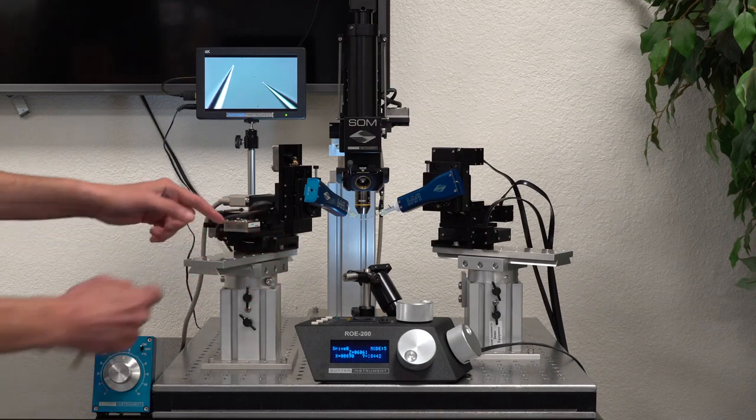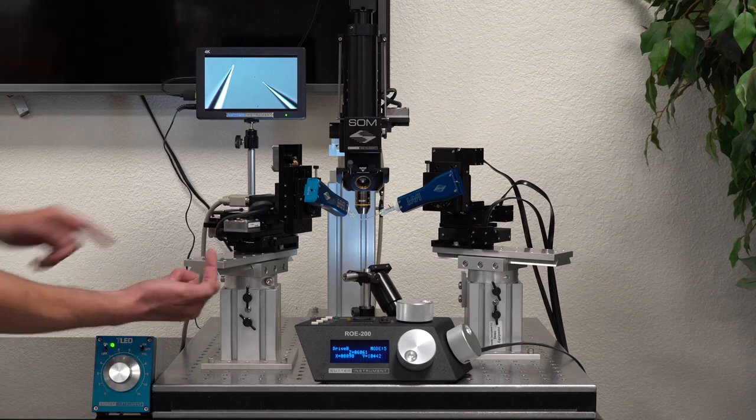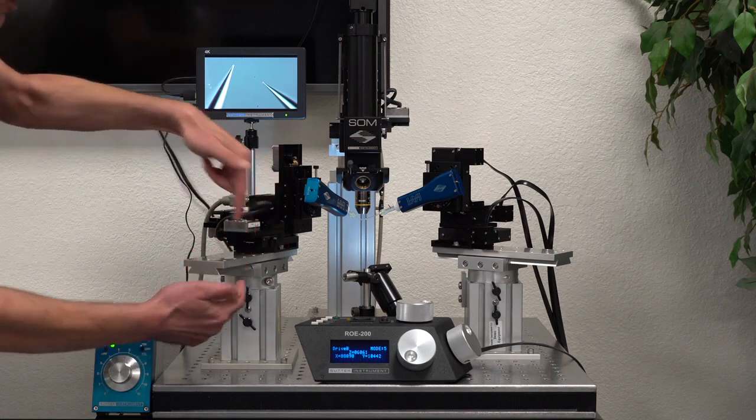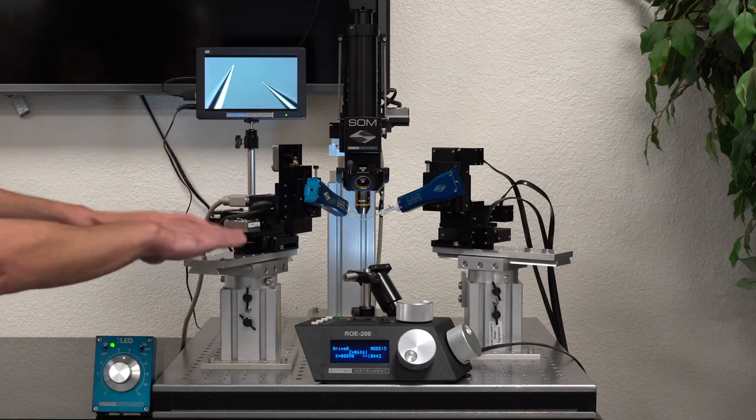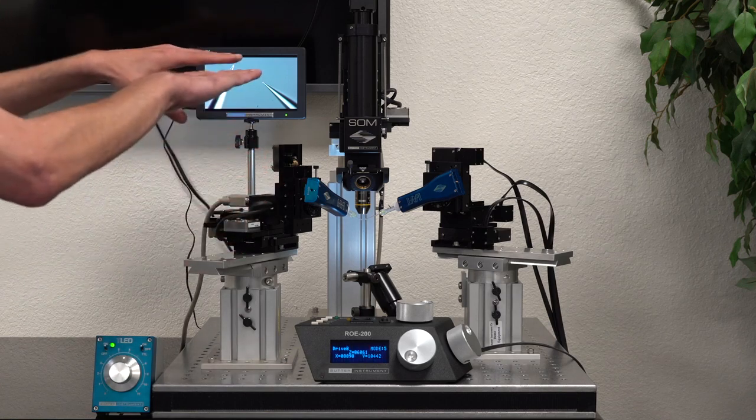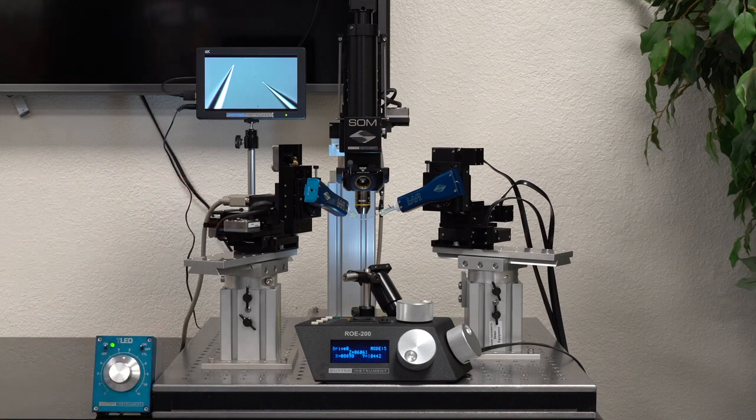To rotate the stand on the center post here which gives you the Y-freedom. Also to take it up and down which gives you the Z-freedom.